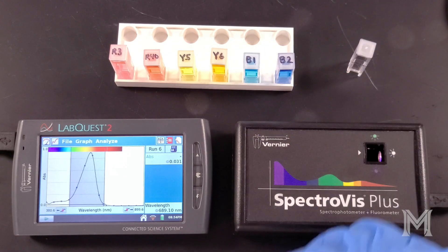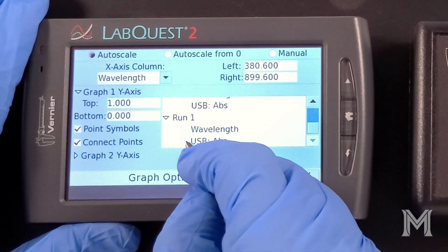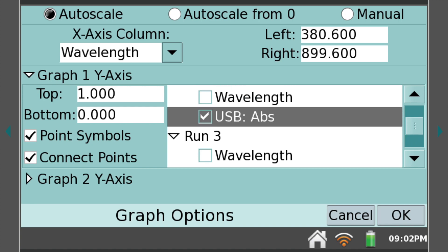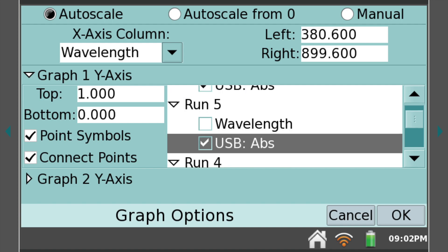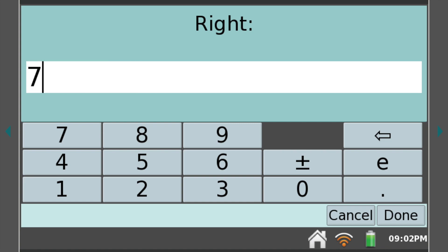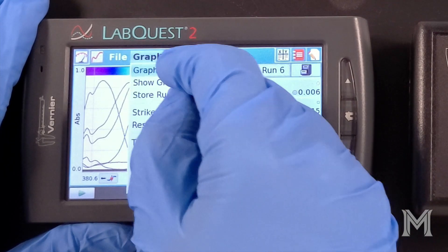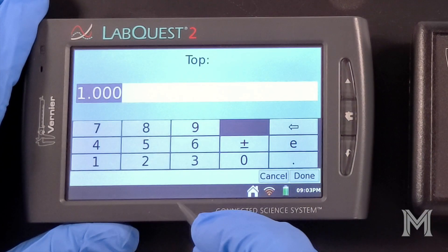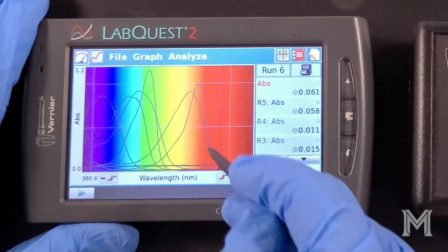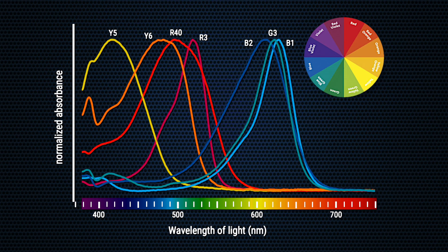To examine all six spectra side by side, select Graph Options from the Graph menu, then select each of the absorbance spectra you wish to display — we'll select runs 1 through 6. You can deselect point symbols to make the graphs clearer, and adjust the x-axis to about 750 nanometers to trim the infrared range. Adjust the y-range top value to something like 1.2 if peaks are cut off. Now we can see how each of our dyes has a unique, almost fingerprint-like absorption spectrum, which we can use to identify each dye and pick out colors present even in a mixture.